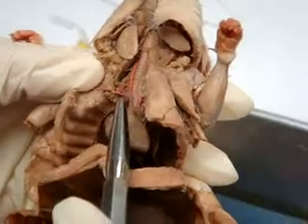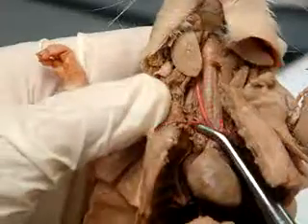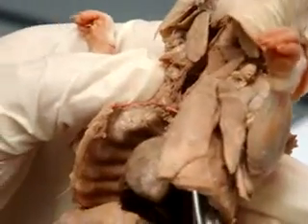So, see this little artery back here? That's going straight down? Rotating. It's going down. It's right under my blunt probe. Oh, that one. That little tiny one? Everybody seen that little tiny one? That's your costocervical artery.